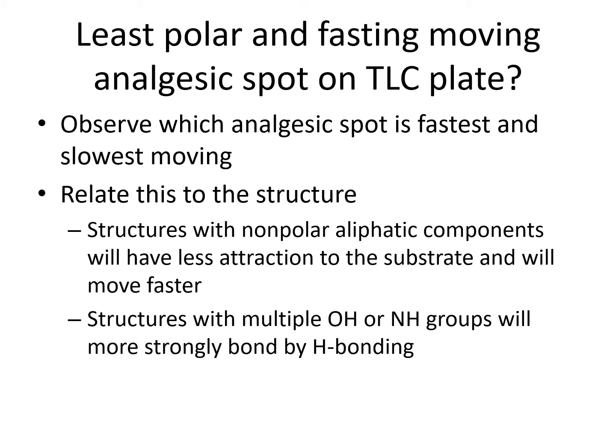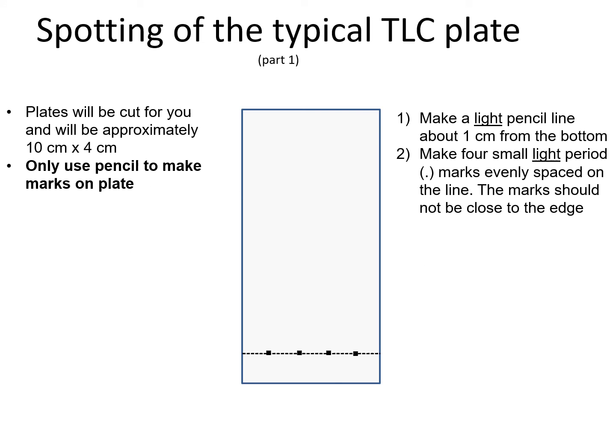From this experiment, you can tell that the compounds that are polar should be the compounds having polar functional groups. If you go back and see the slides, those compounds having hydrogen bonds like OH and NH bonds are chemically polar, and they will have higher affinity to stationary phases. So during the experiment, the first thing to do is just preparing the TLC.